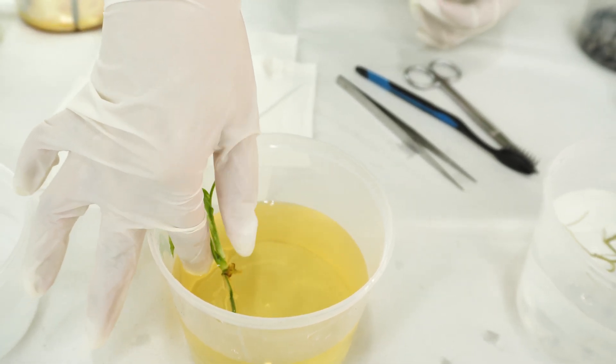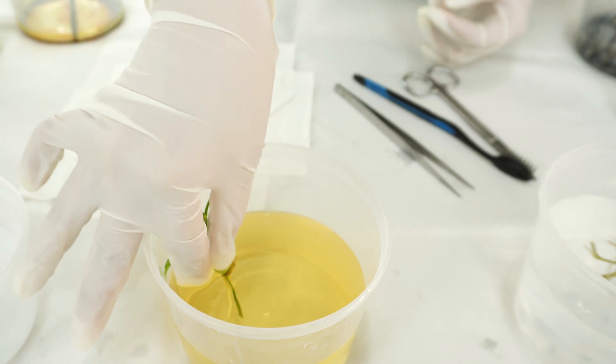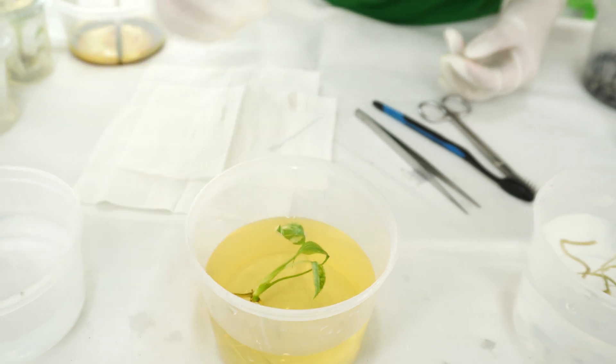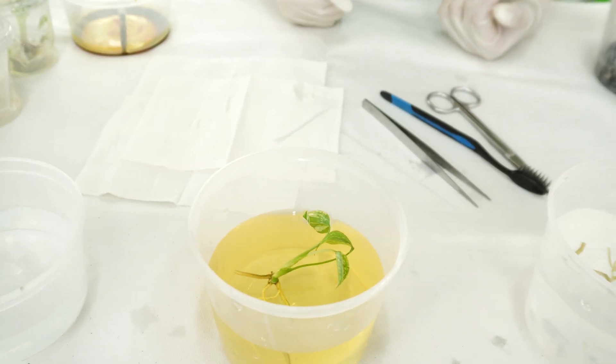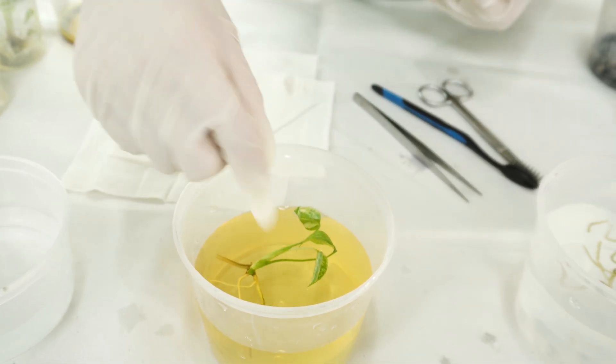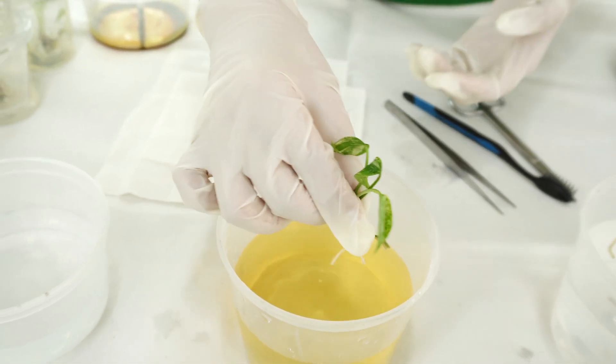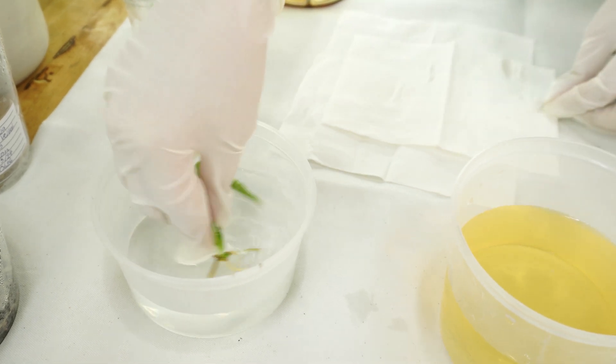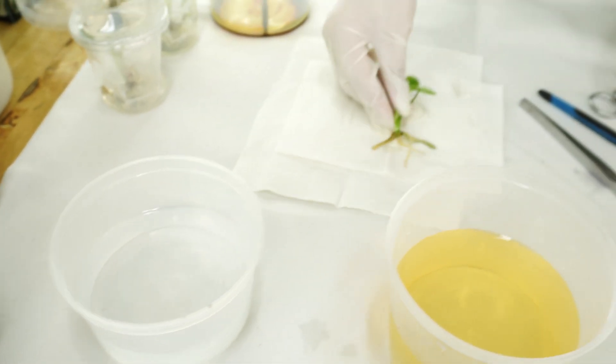After cleaning the plant, drop it into the iodized solution. You can leave it in the solution for about one to three minutes, then transfer it to another container of clean water to rinse it, and then dry it with a tissue.